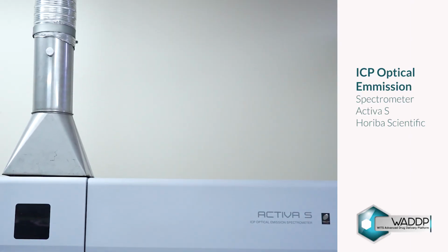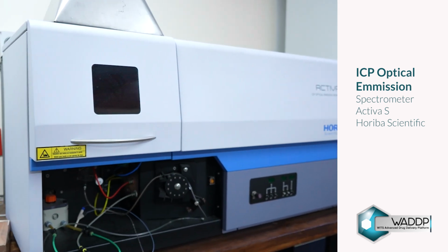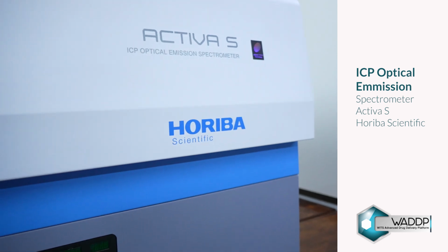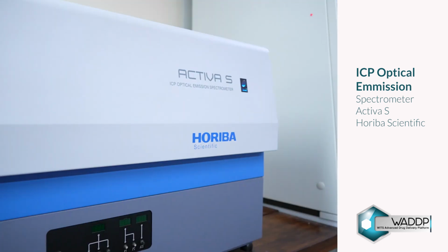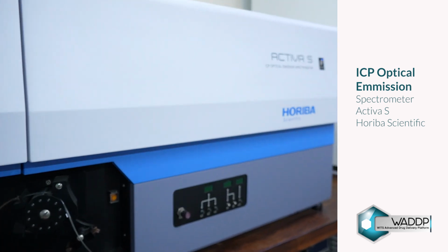The ICP-OES is used to determine the concentration of different chemical elements in a liquid sample. It operates by using extremely high heat to make the atoms in a sample emit light, which is then measured to identify and quantify the elements present.